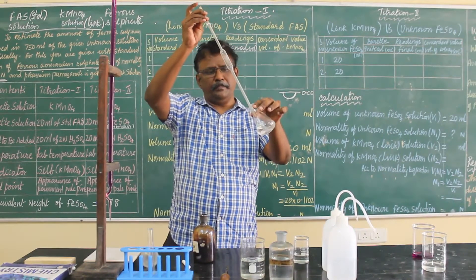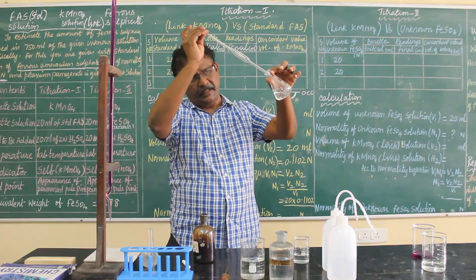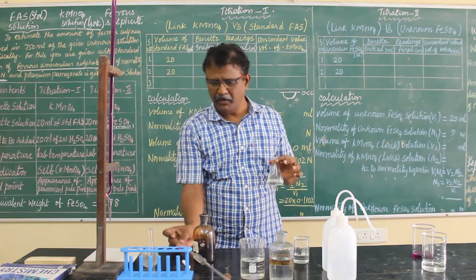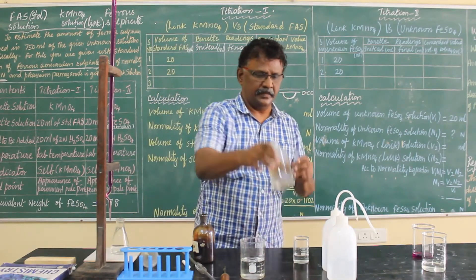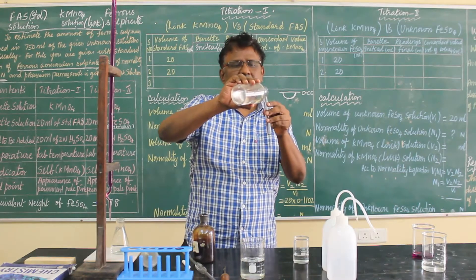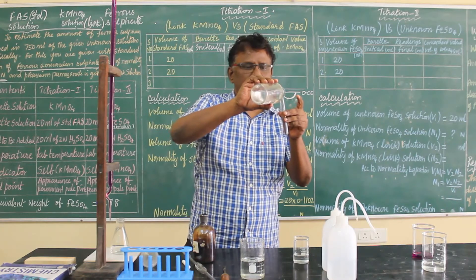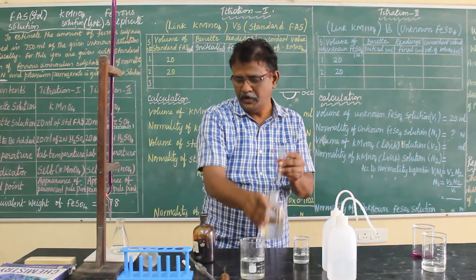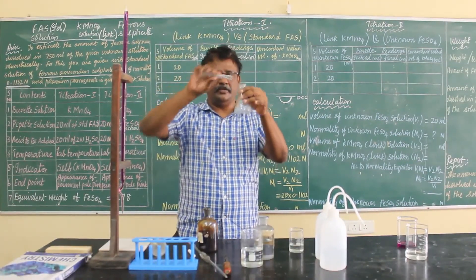Don't blow the pipette — just tilt the conical flask and tap the pipette on the side two times and take it out. That gives only 20 ml. Now you have to take one test tube of dilute sulphuric acid, approximately 20 ml. Take one test tube of dilute sulphuric acid and add it along with the pipette solution into the conical flask.